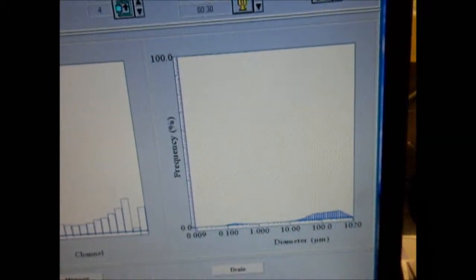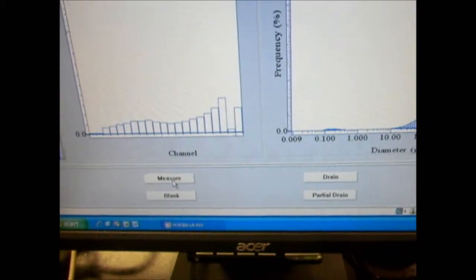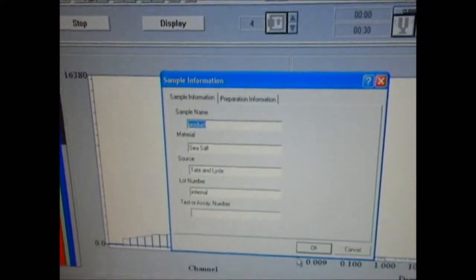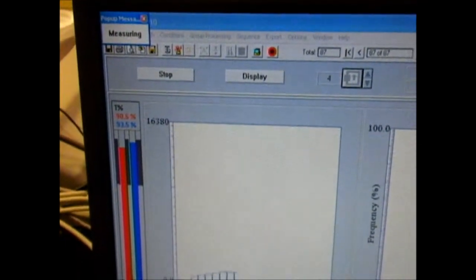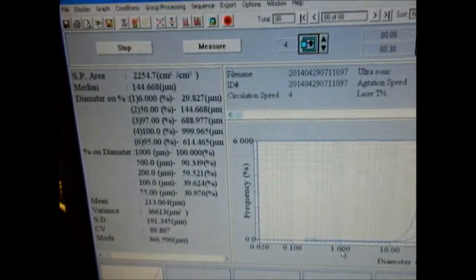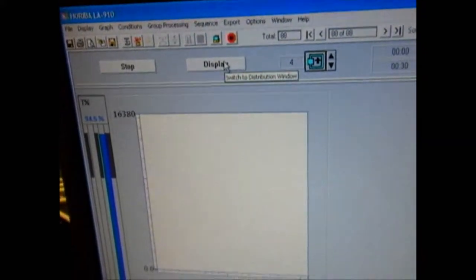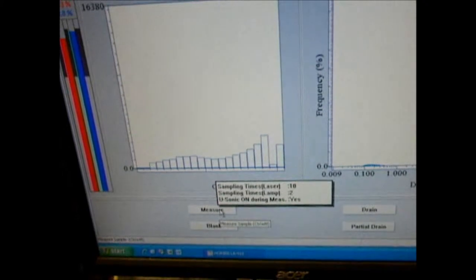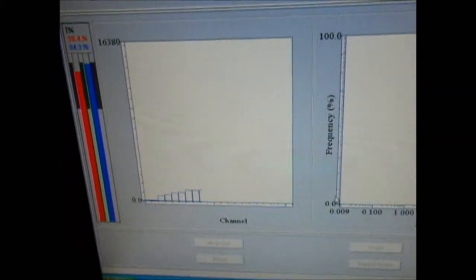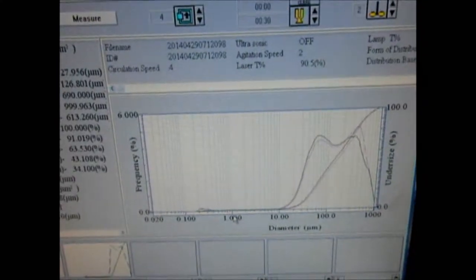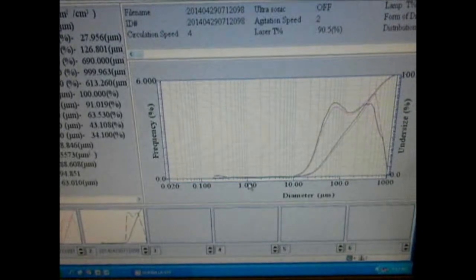I'm going to click Measure. It will give you the name of the material — just verify everything is correct and select OK. This instrument should now measure. We want to do this measurement a couple of times, so I'm going to move the cursor over to Measure again. With a sample like this that has a fairly broad distribution, you may need to do a couple of measurements. These two results are fairly consistent, which is to be expected with a broad distribution.